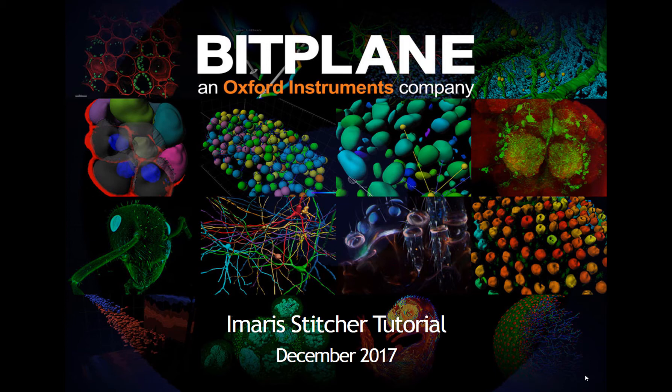Imaris Stitcher is a program for stitching overlapping 2D, 3D, and 4D tiles in X, Y, and Z. The software loads image tiles using stage coordinates, provides a preview of those tiles and their arrangement, aligns the tiles, and then finally stitches them together into one large image.